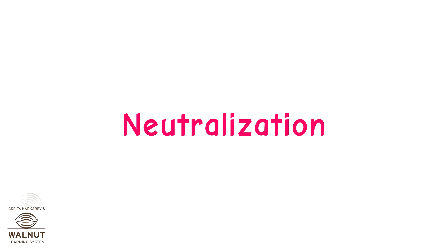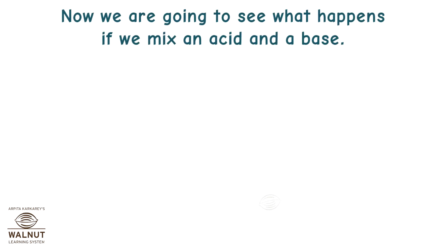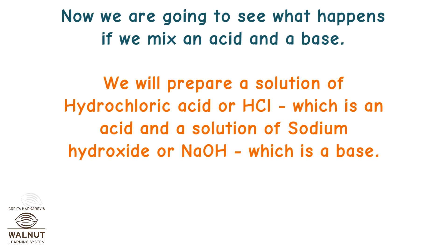Neutralization. We are going to see what happens if we mix an acid and a base. We will prepare a solution of hydrochloric acid or HCl, which is an acid, and a solution of sodium hydroxide or NaOH, which is a base.